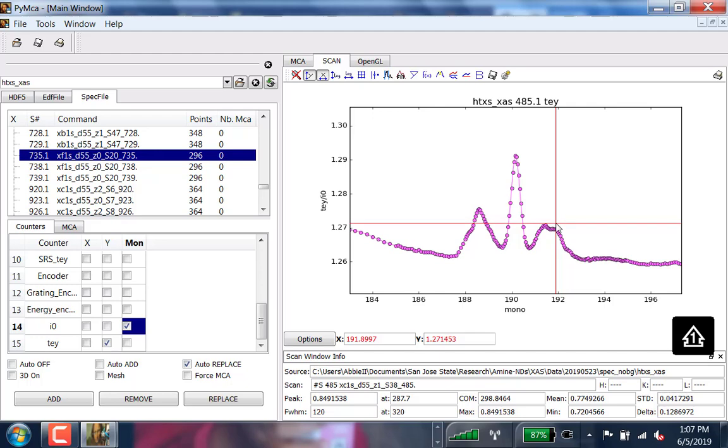So we've got what appears to be five individual peaks, which probably represent carbon-boron, boron-chlorine, boron-oxygen related bonds. And these would still be representative of those same anti-bonding orbitals that we described for carbon. So the boron 1s electrons have now made a transition to some anti-bonding orbital.